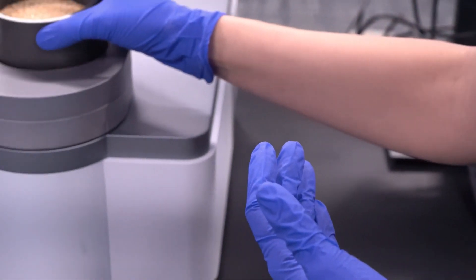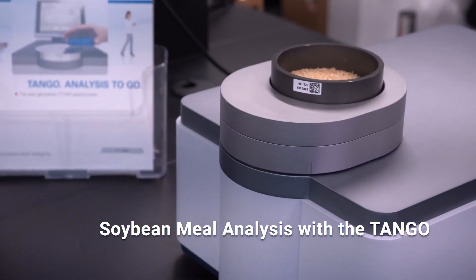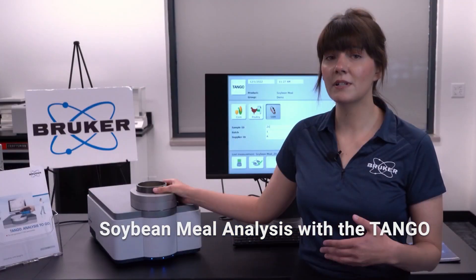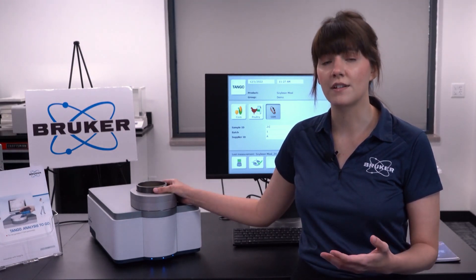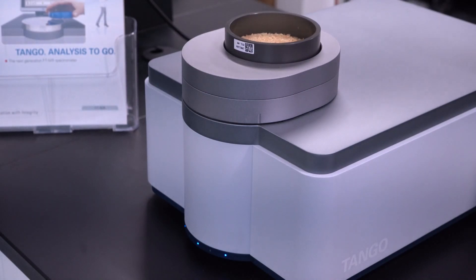Have you guessed it yet? That's right, today we're talking Tango, soybean meal edition. Soybean meal is typically the highest expense in raw materials, and its nutritional profile depends upon its extraction method or any preparatory work that was done, such as extrusion or dehulling.